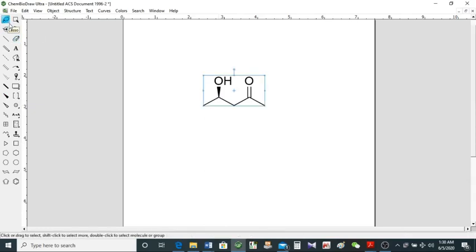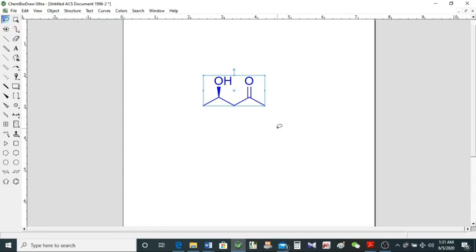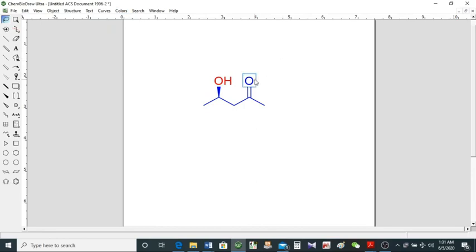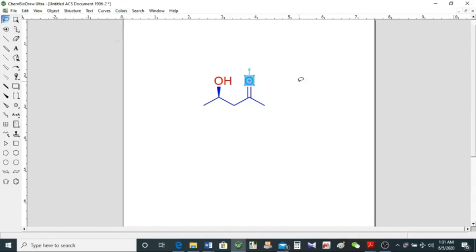I'll delete this stereochemistry for now. Select the molecule — if you don't like the color you can change it. Change the color from here and the whole molecule is blue now. If you want functional groups in a different color, select that part like the OH and make it red. You can also keep the oxygen in blue, and even change a single bond's color from the rest by selecting that bond and changing the color.